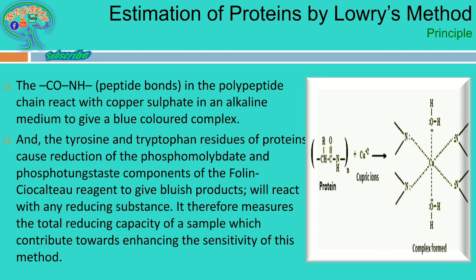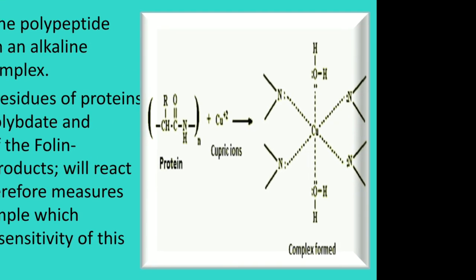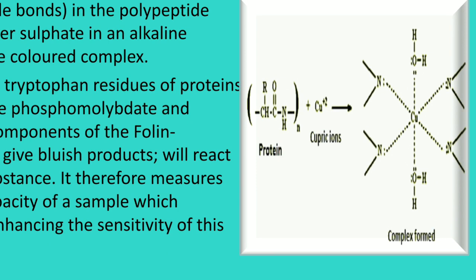Here this is the peptide bond in the polypeptide chain which reacts with copper sulfate in an alkaline medium to give a blue colored complex. If you observe this particular reaction, you can see this is the protein.